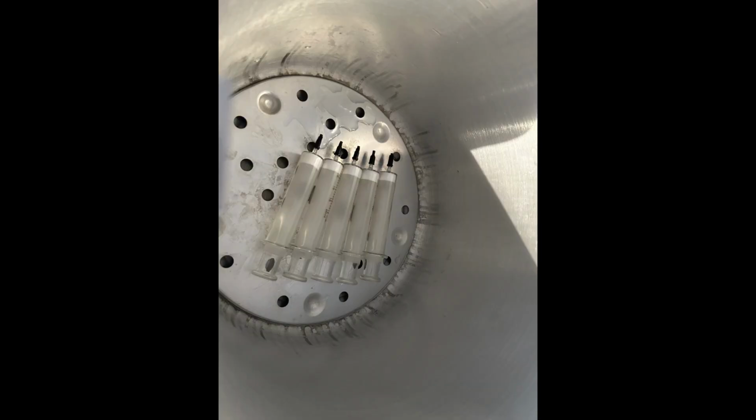I really wish I knew where the heck I read this and thought it was a good idea. Good enough of one to give a dedicated spot in my lab notebook. And what the heck did I think when I was buying glass syringes? I autoclaved it with this cotton ball shoved in there. I probably should have stuffed it in the tip of the syringe, not in the barrel, but oh well.